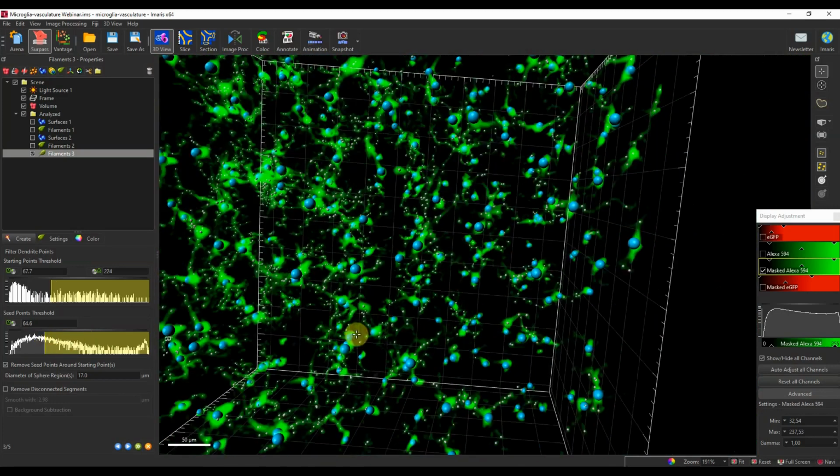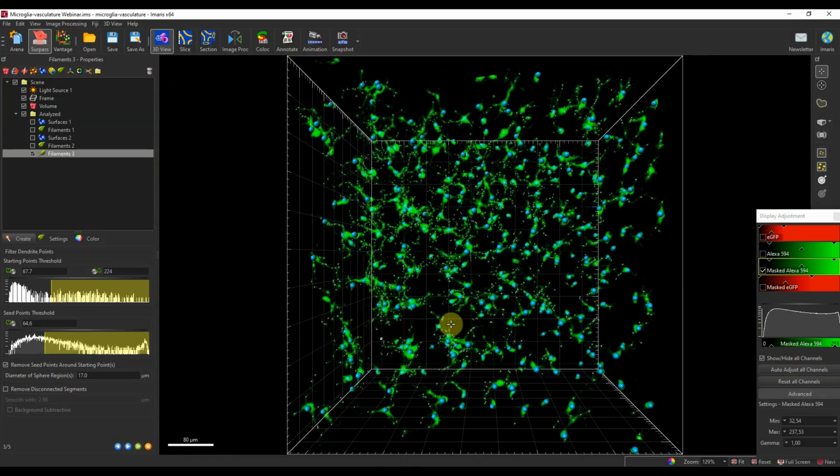Okay. I would say, to me, just looking at it, this already looks quite nice. Again, I have the same options, which I will skip again at the moment. And in this case, when I press the next button, the algorithm will commence, and generally it doesn't take too long. However, for time consideration reasons, I will directly show you how the result looks.